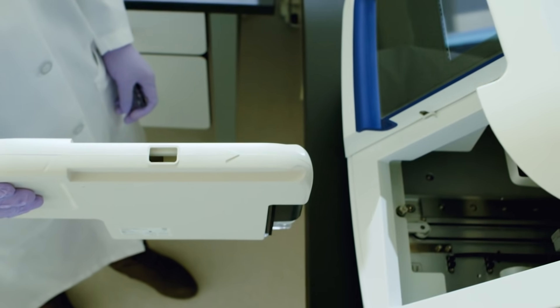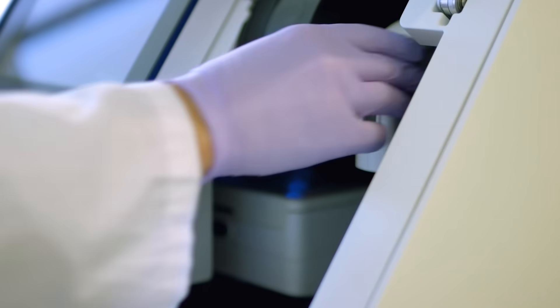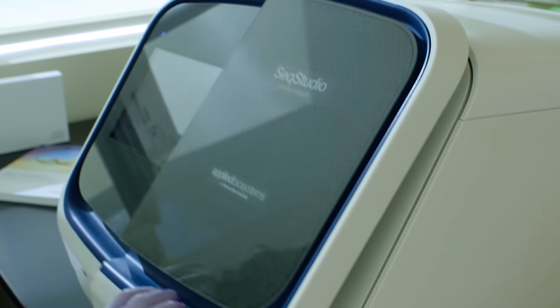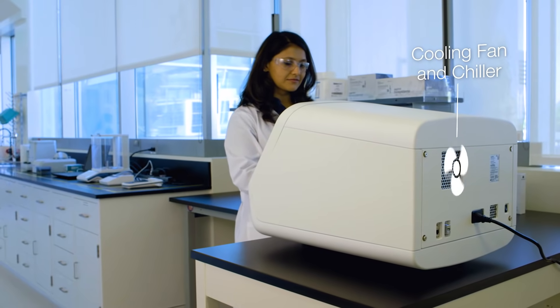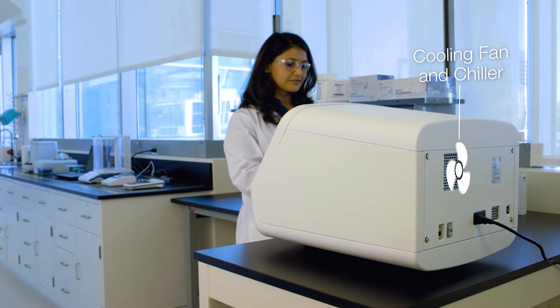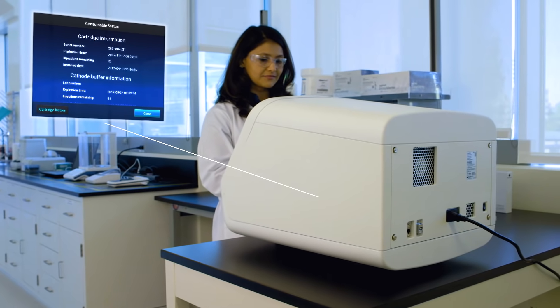One simple step with no fussy capillaries — it clicks right in. A cooling fan on board helps reagents last up to four months. All SeqStudio consumables have RFID tags, so tracking is automated and easy.